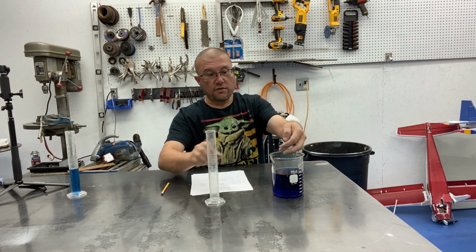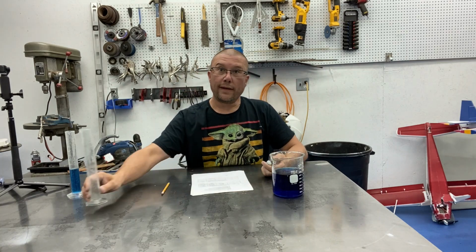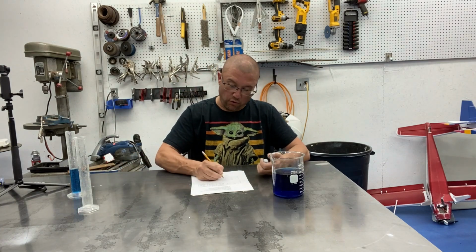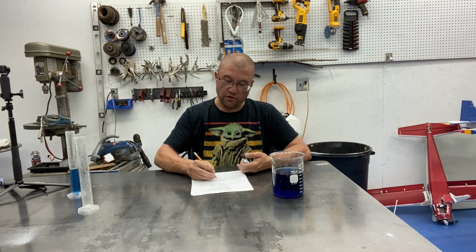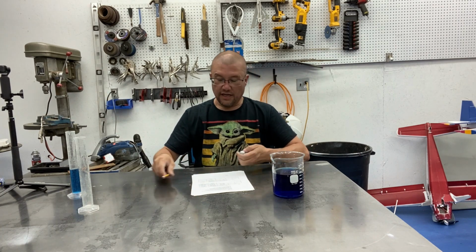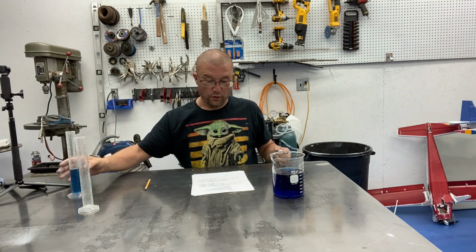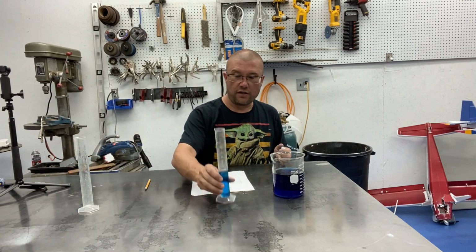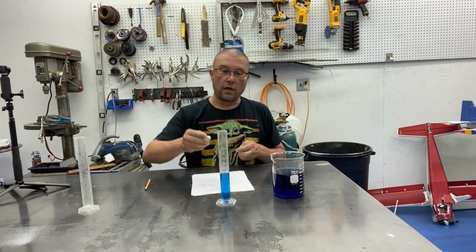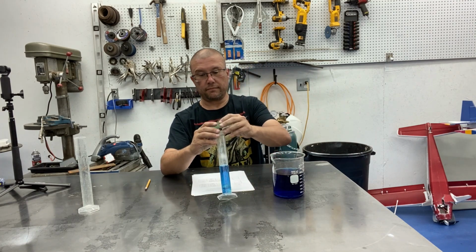So although we changed the shape in trial 2, we got the same results. Make sure you record that in your data table. You started with 50 milliliters of water. It went up to 63 milliliters with the 3 spheres. Now we're going to repeat steps 13 through 17. So we've got another 50 milliliters of water. We're going to drop our 3 same spheres in.